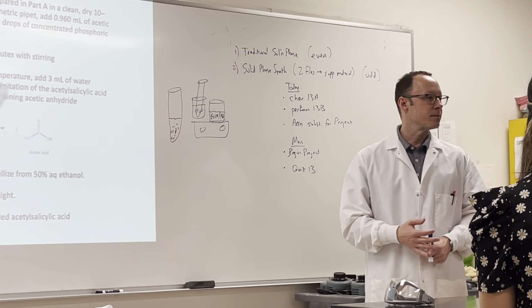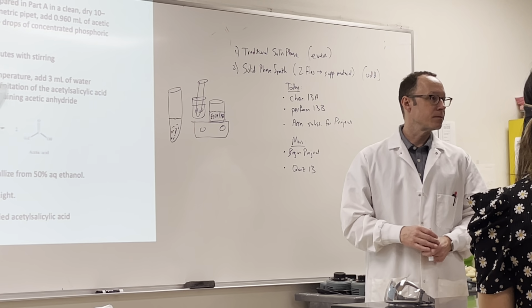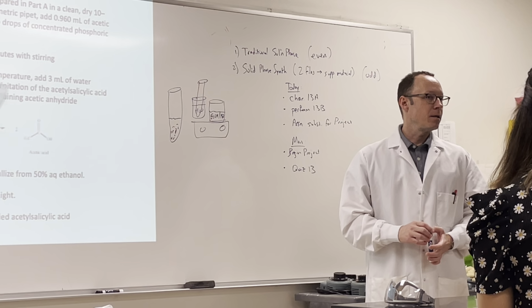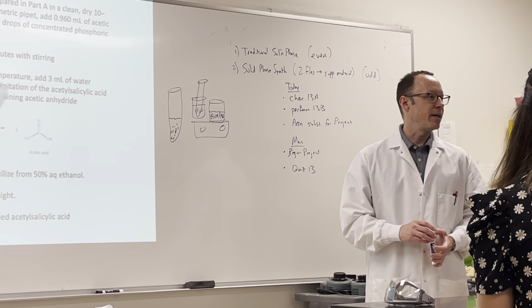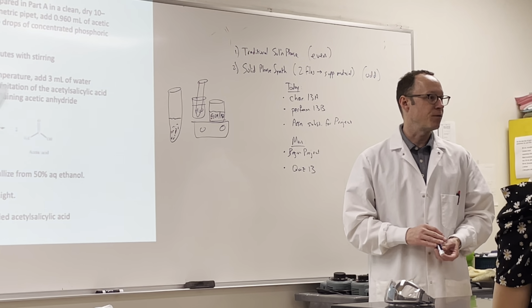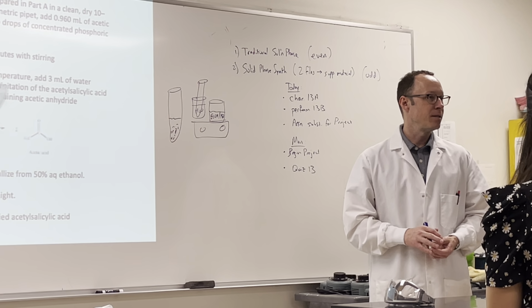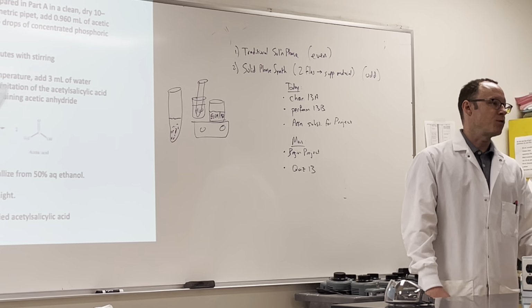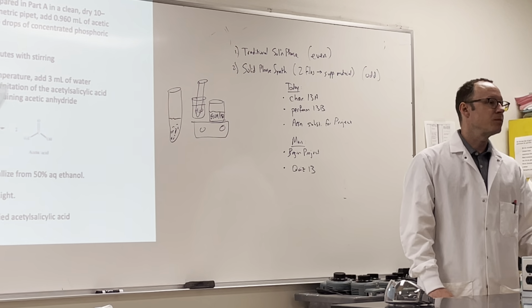Just have a quick question. I still have to separate out my salicylic acid. Will I have to dry that in the oven before doing part B? Yeah, I probably would, just to be safe. You don't have to leave it in there for very long, but just let it sit in there for a few minutes while you get everything prepared for the next part. I mean, mostly just because you don't want to characterize wet product.